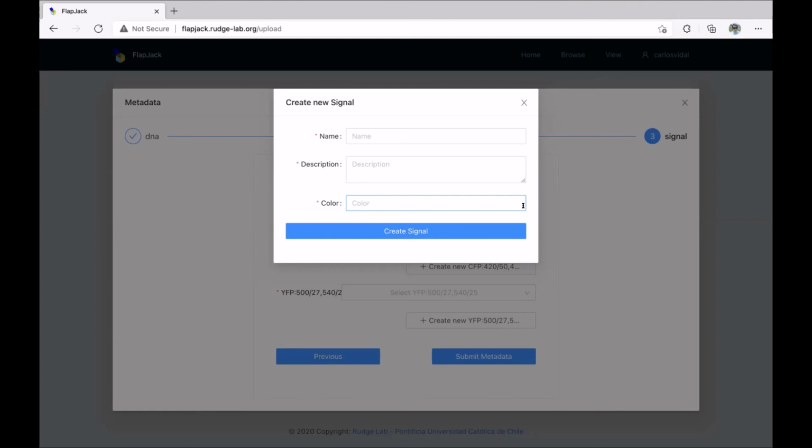And I think we should have somewhere in the GitHub repositories example Excel files that you can take as a template and just modify, remove the data tab, for example, and put your data in there.